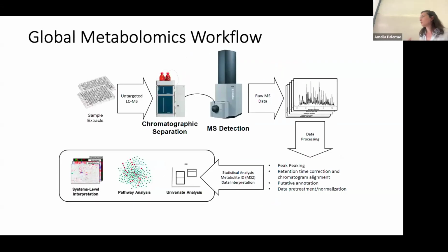Okay, so let's look closer into the workflow. We generally start with a sample prep protocol, which really is at the level of what is depicted in this slide. The sample prep protocol can be tuned in different ways, and it really depends on what is the aim of our analysis. So when we aim to have a very broad coverage, then of course we will tune that sample prep, and there are many different approaches to do that.